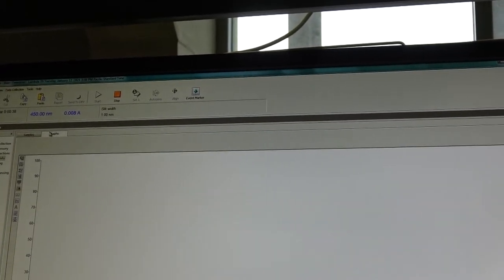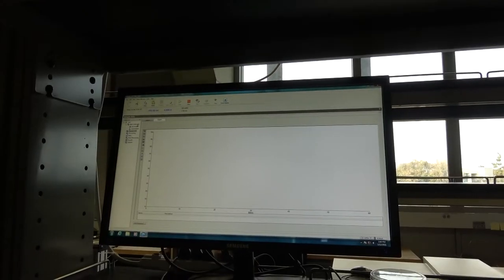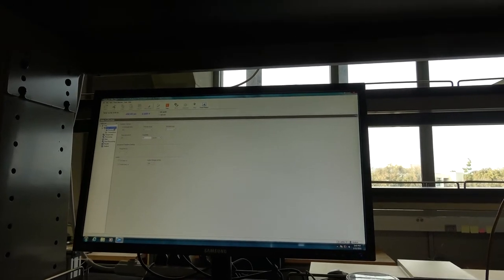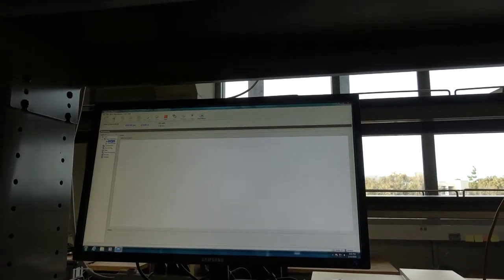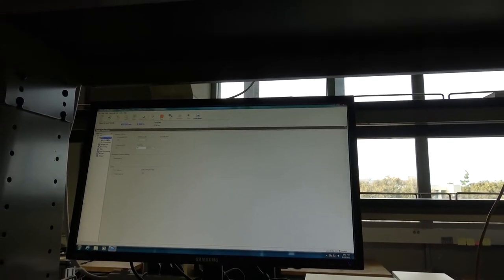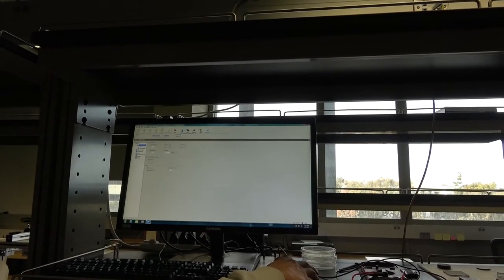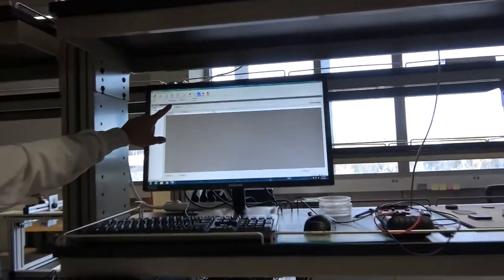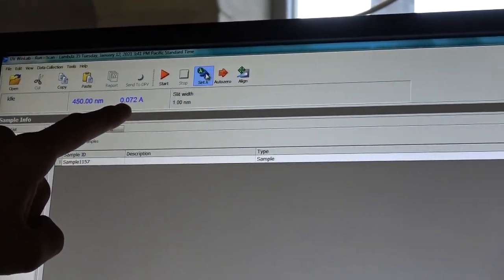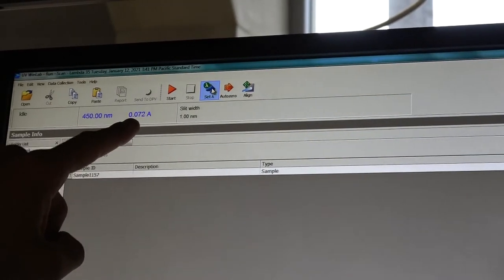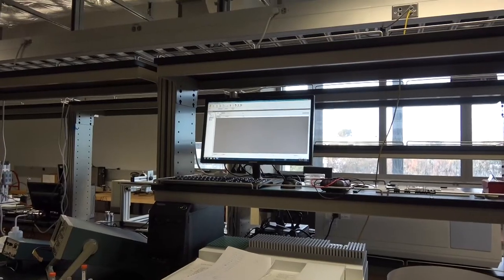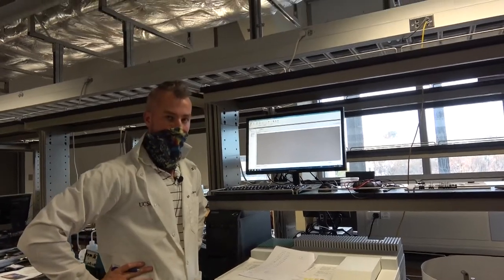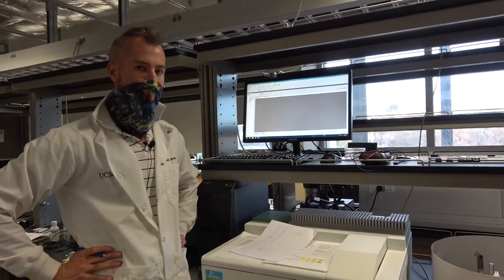Time elapsed is right here, so it's going to wait until it gets to 30 seconds and then take a measurement. You can use these 10 seconds to meditate or check your phone. We're coming back in three, two, one.